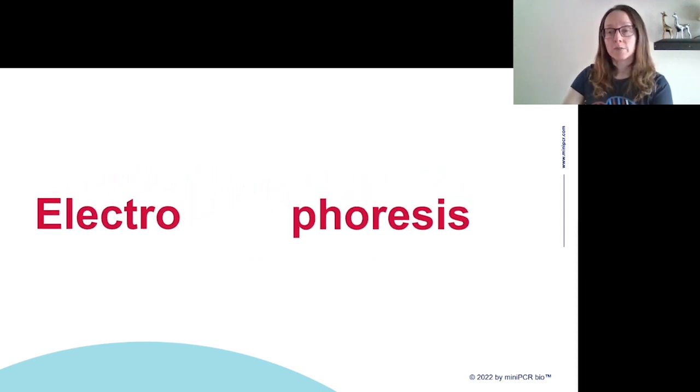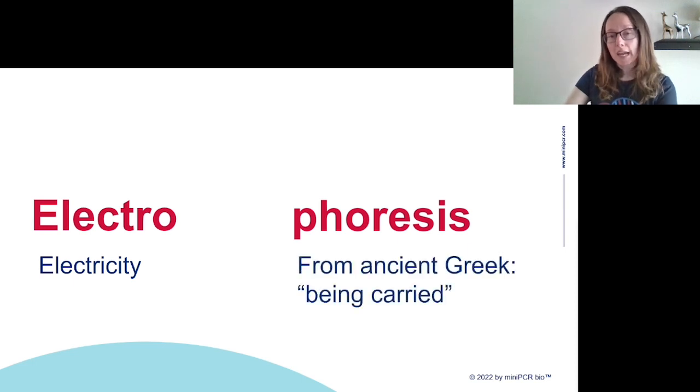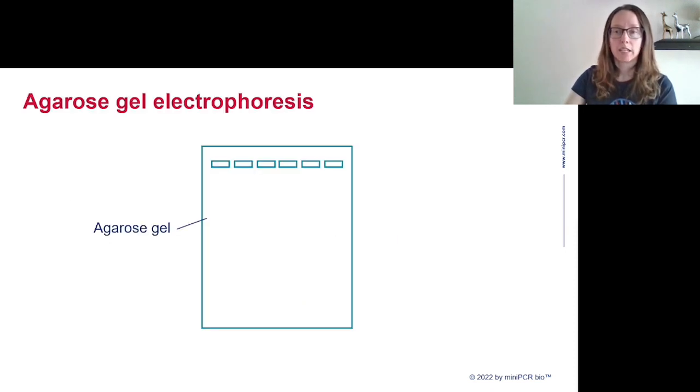We can then use electrophoresis to separate DNA fragments based on their size to distinguish C. crossleyi DNA from DNA belonging to other lemur species. If we break the word electrophoresis down, it'll tell us how we're going to be doing that. Electro comes from electricity, and phoresis comes from ancient Greek and means being carried. So we're going to use electricity to carry DNA through our gel and separate it by size.